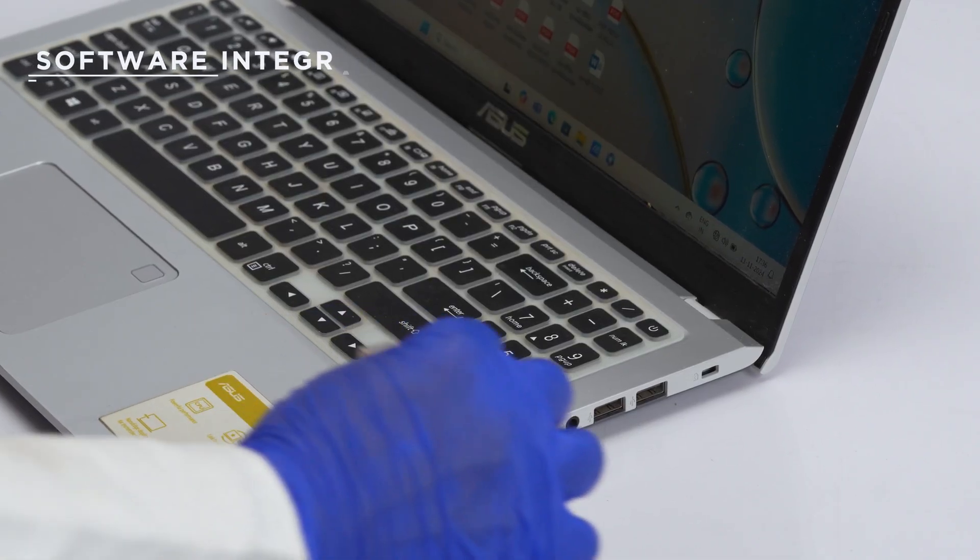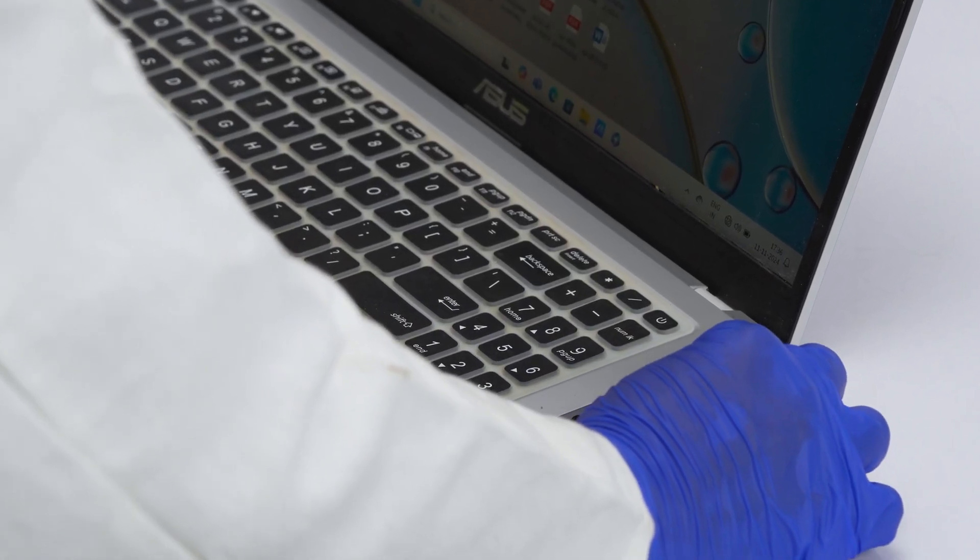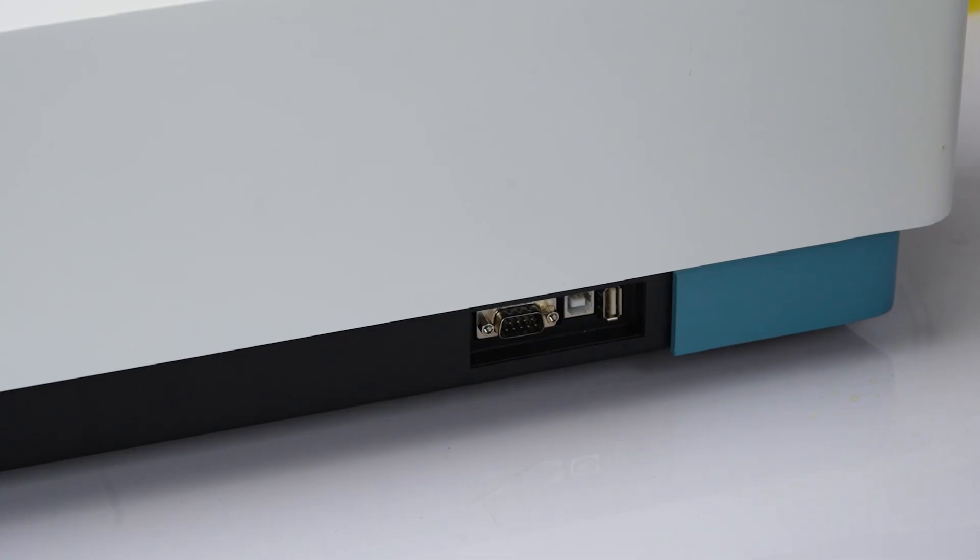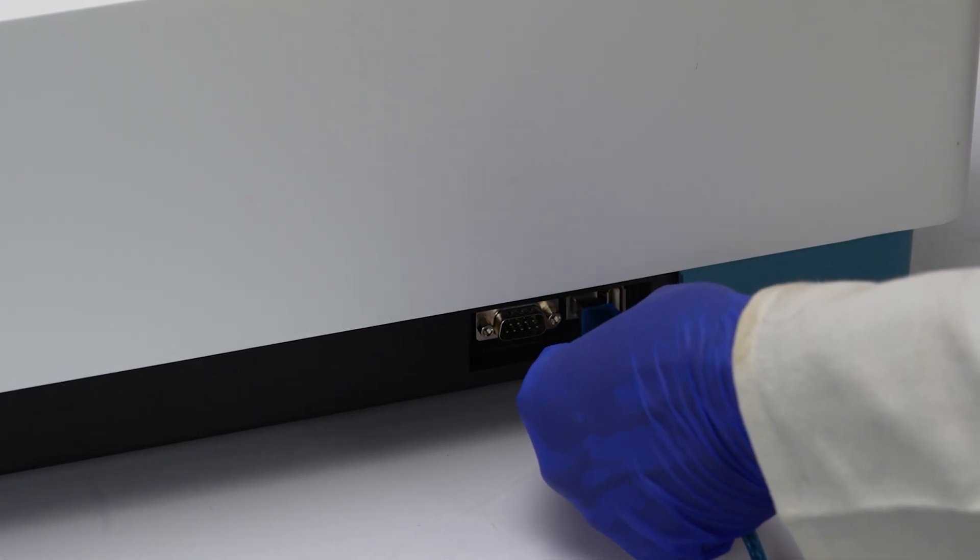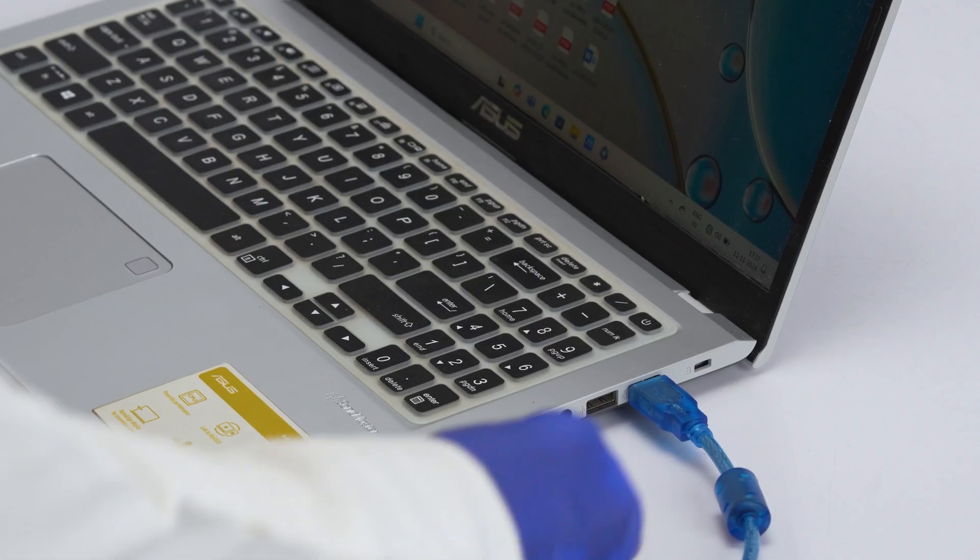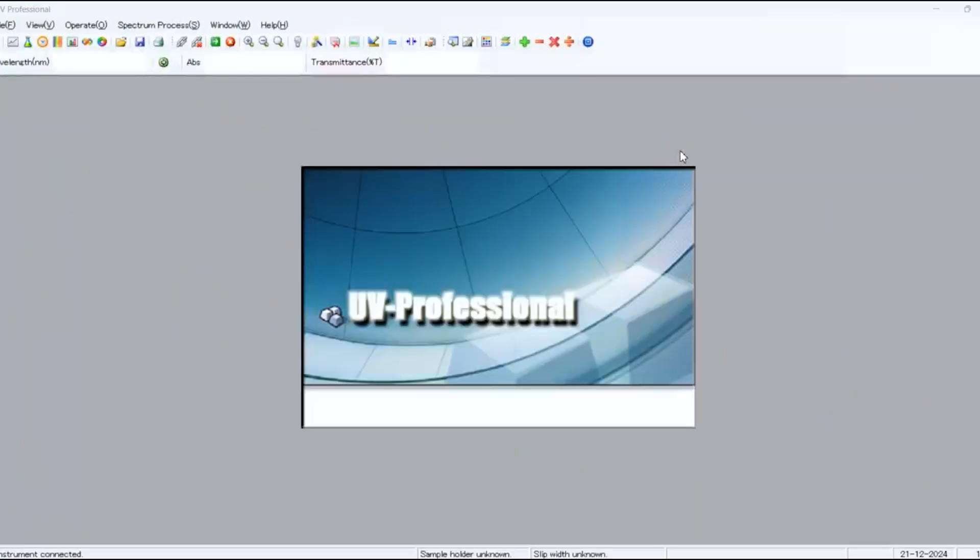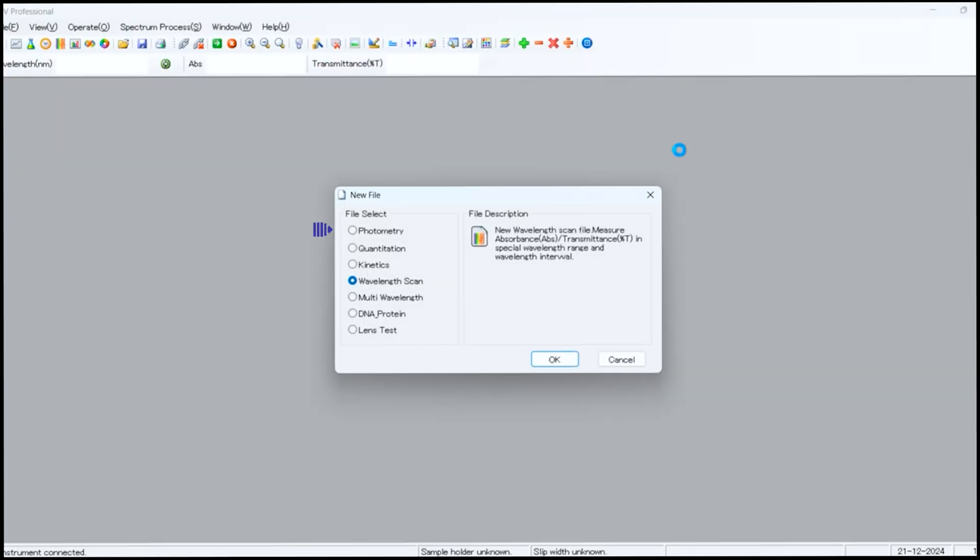Connect the UV1950 to your computer using the connection cable. Insert the dongle key. The software interface provides additional options including photometry, quantitation, kinetics, wavelength scan, and multi-wavelength DNA and protein analysis. All these tools are also accessible via the toolbar.